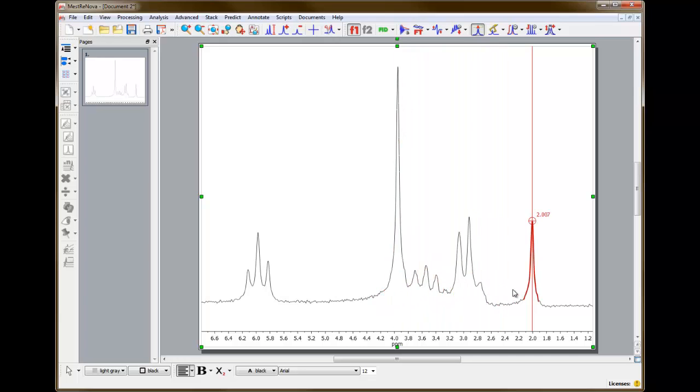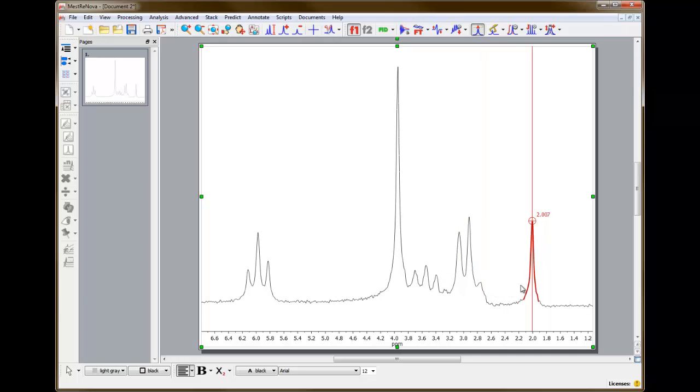To this sample of propylacetate, I added TMS as a chemical shift reference, and so the rightmost signal in the spectrum is due to TMS and should be referenced to 0 parts per million.